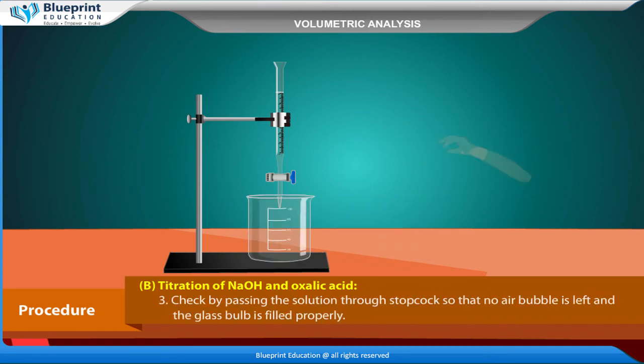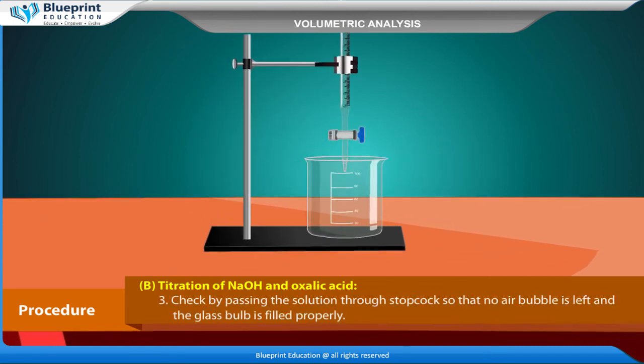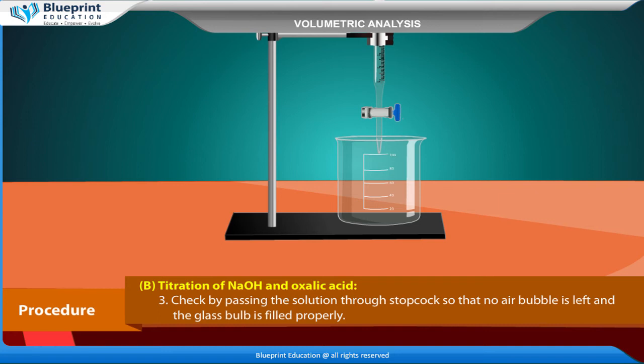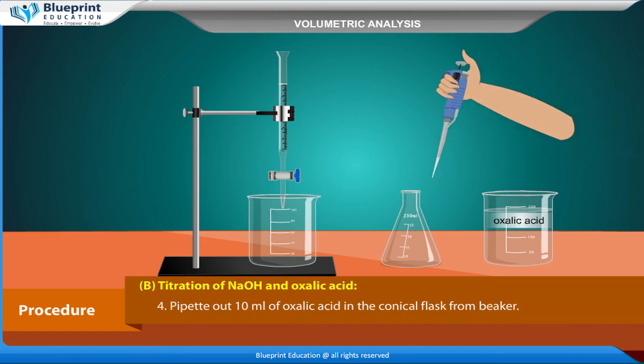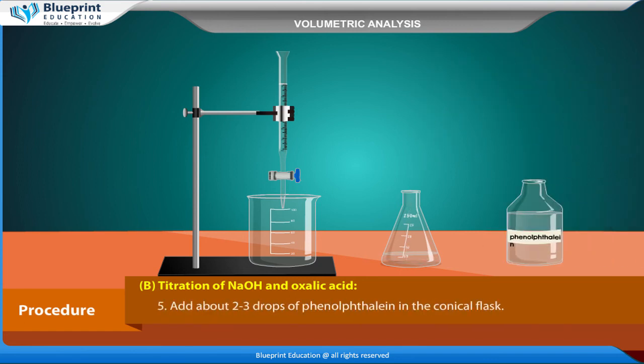Check by passing the solution through stop cock so that no air bubble is left and the glass bulb is filled properly. Pipette out 10 ml of oxalic acid in the conical flask from beaker. Add about 2-3 drops of phenolphthalein in the conical flask.